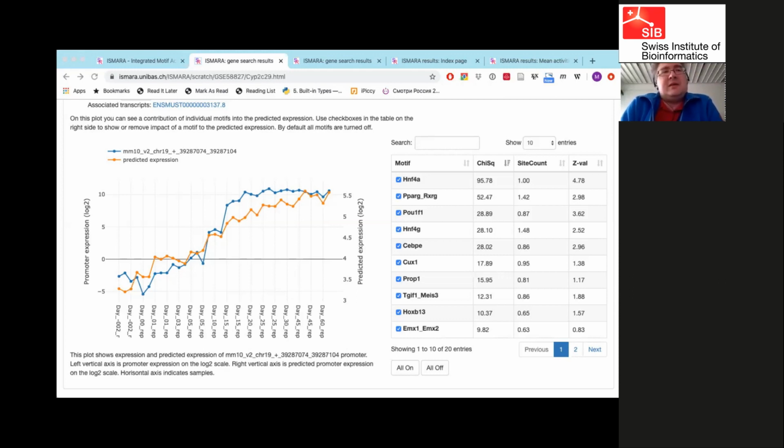It contains the main page, all tables, all pictures, all motif pages, and so on. What is missing from the downloaded report are the pages per individual gene.